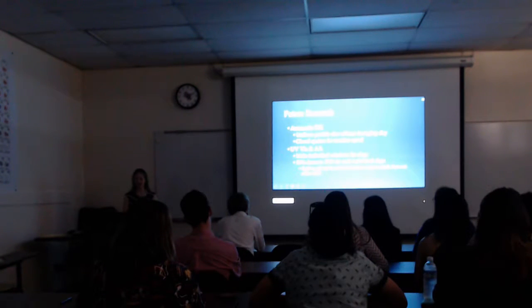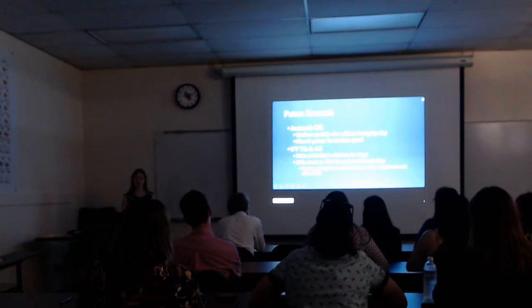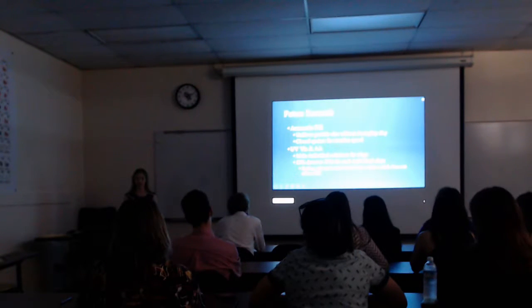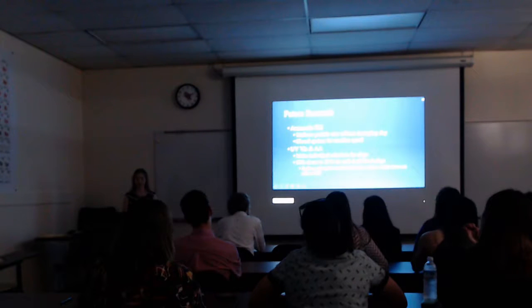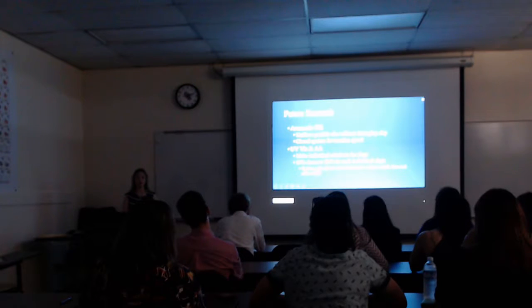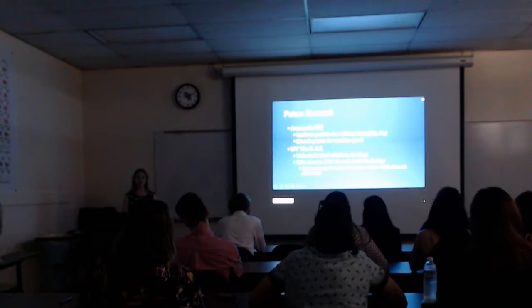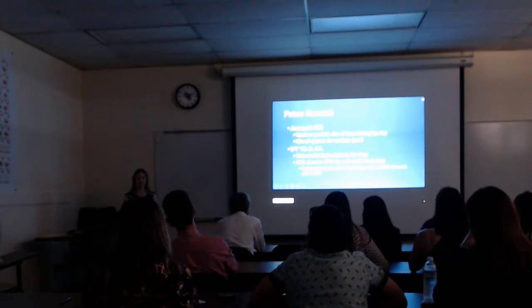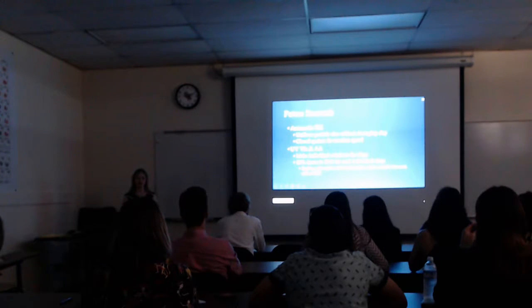On the UV-vis and AA, we're going to attempt to make those individual stock solutions. Unfortunately, we're going to have to do more dishes in order to do this. And we're also going to lower our 50% excess to 25% excess for each of the individual clays. We're hoping that by reducing the adsorption of the metal to the clay surfaces, we'll get a more accurate CEC. Because the amount of metal ion adsorbed onto the surface doesn't actually have an effect on the CEC. CEC is only based on the exchanged metal ions.